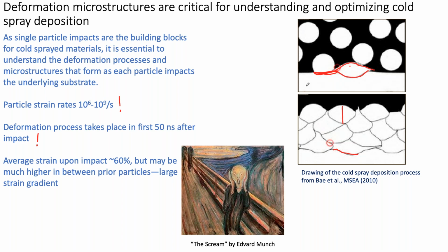I see crystalline material. The only time I have seen amorphous materials was in that work right at the interface between the aluminum and the steel. Like I said, it was about a 2 to 5 nanometer amorphous region. Interestingly enough, at the same length scale in the aluminum to aluminum interface impact, it was completely crystalline on both sides.